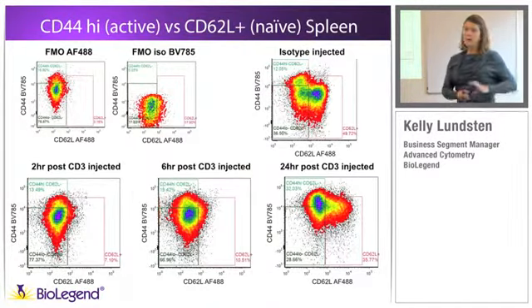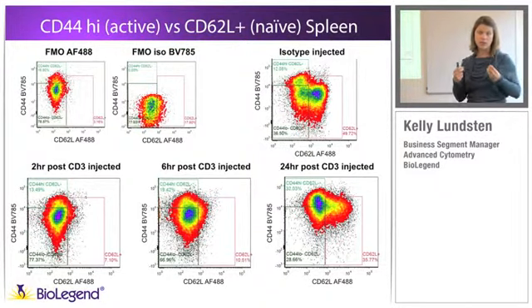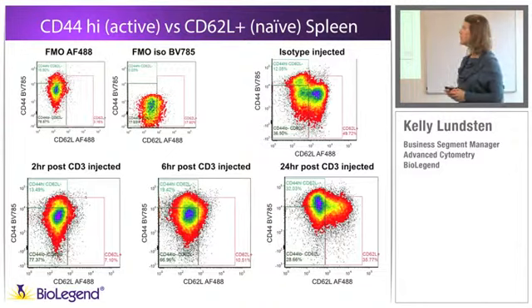So that's definitely a warning sign, right? You can solve some of that with analysis, but this is one of the reasons we think so heavily about how to match the fluorophores.